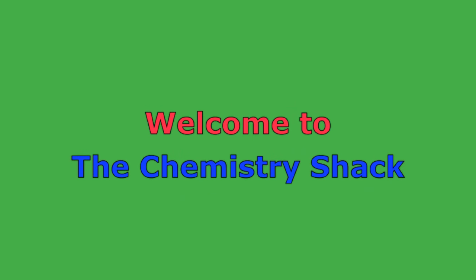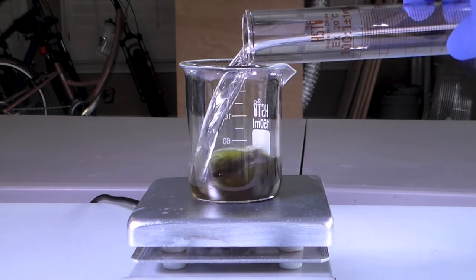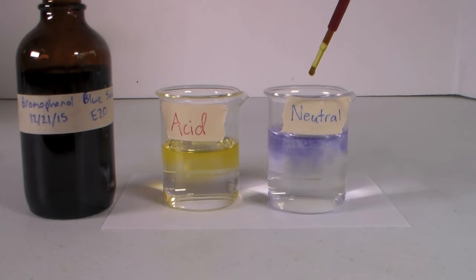Hey guys and welcome to the Chemistry Shack. In this video I'll be showing you how to make a bromophenol blue indicator solution.